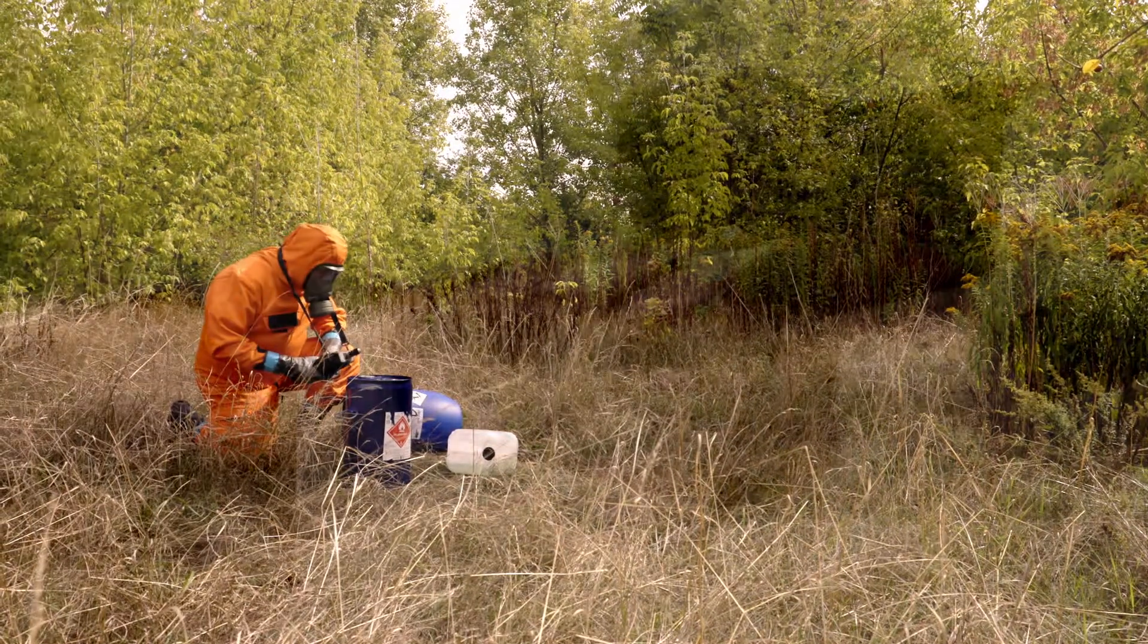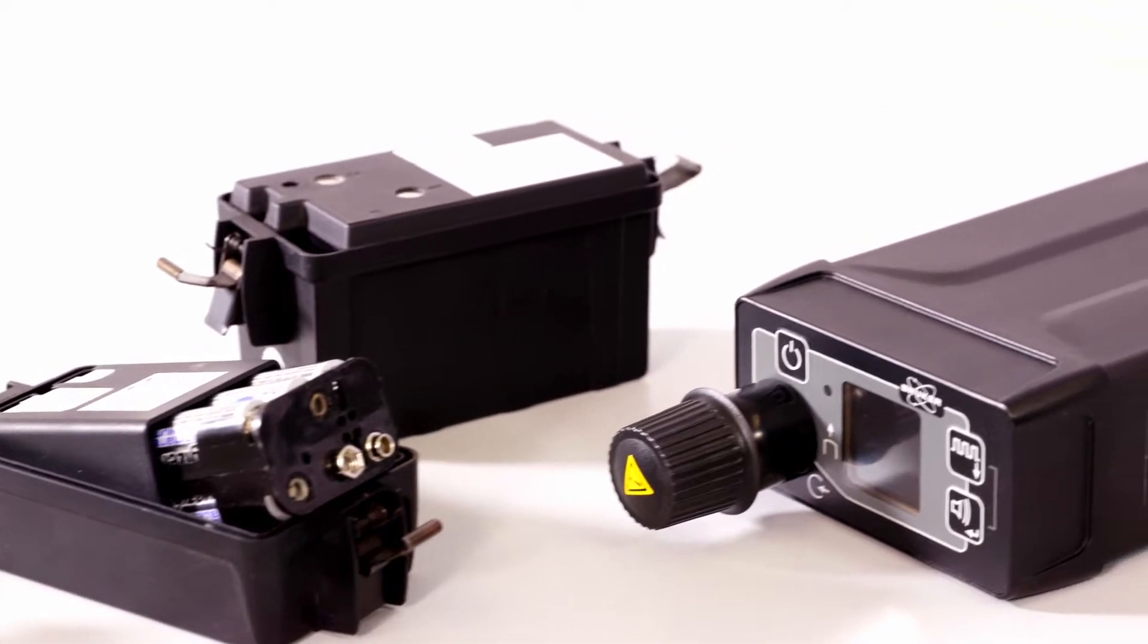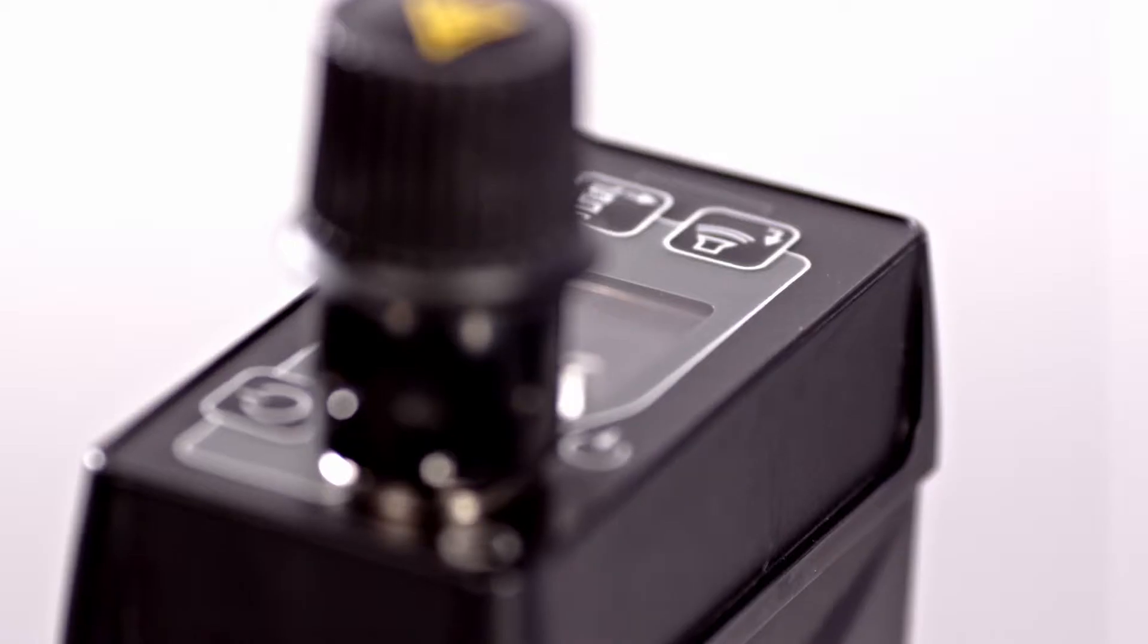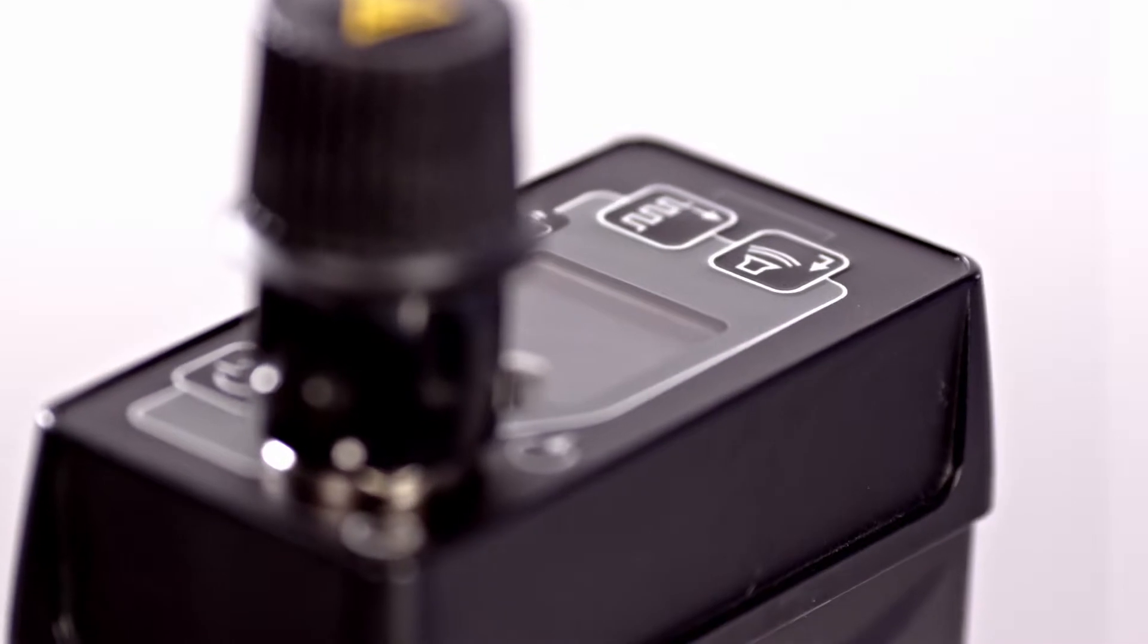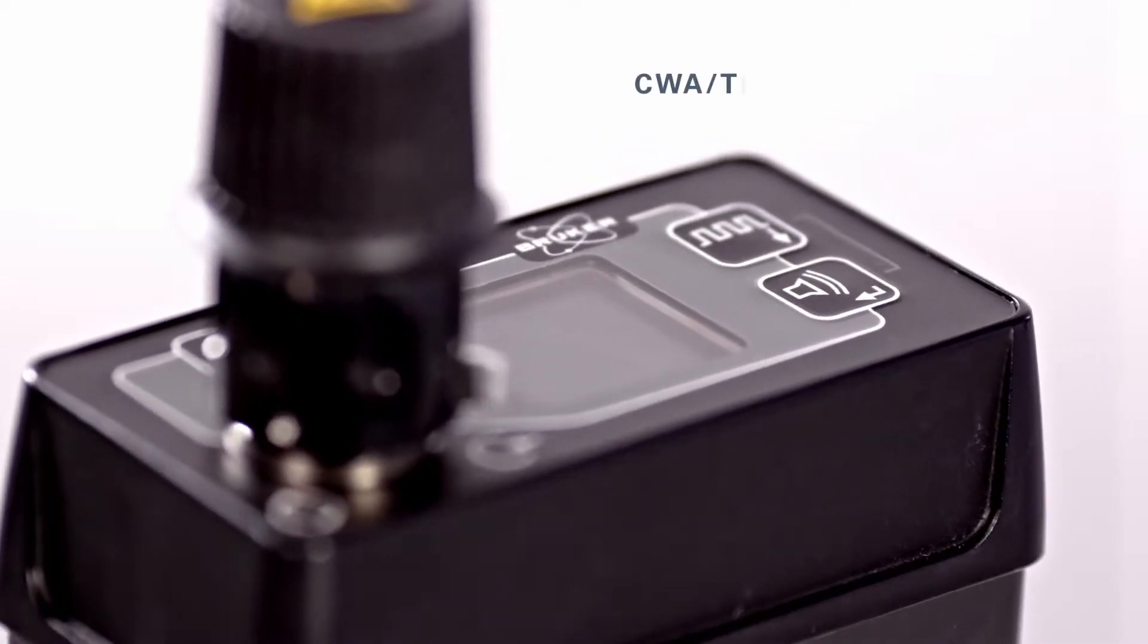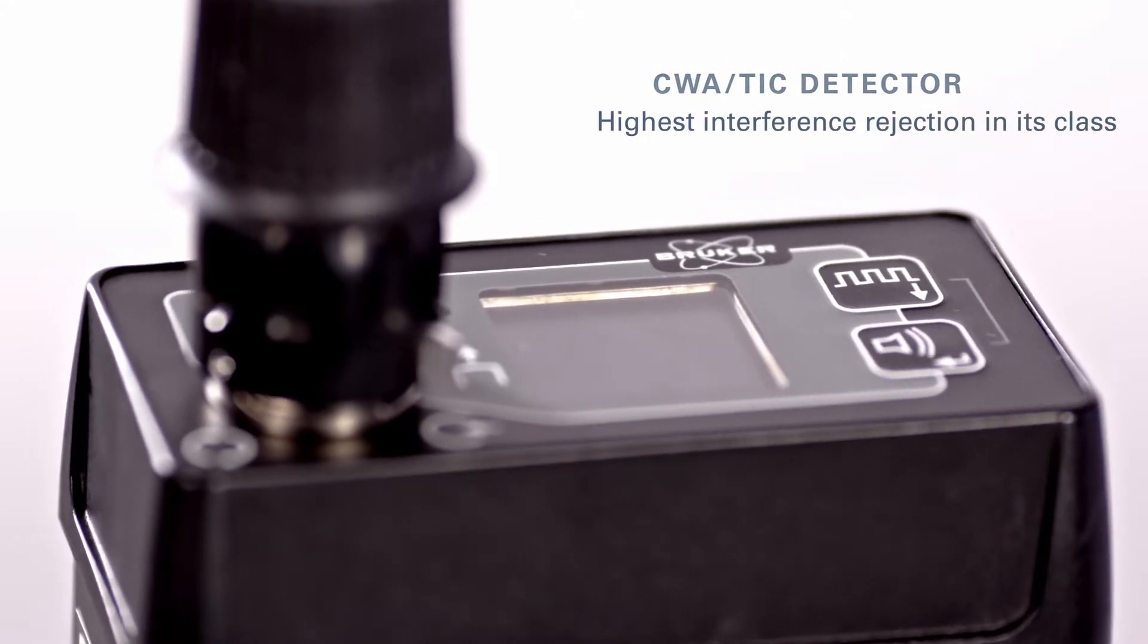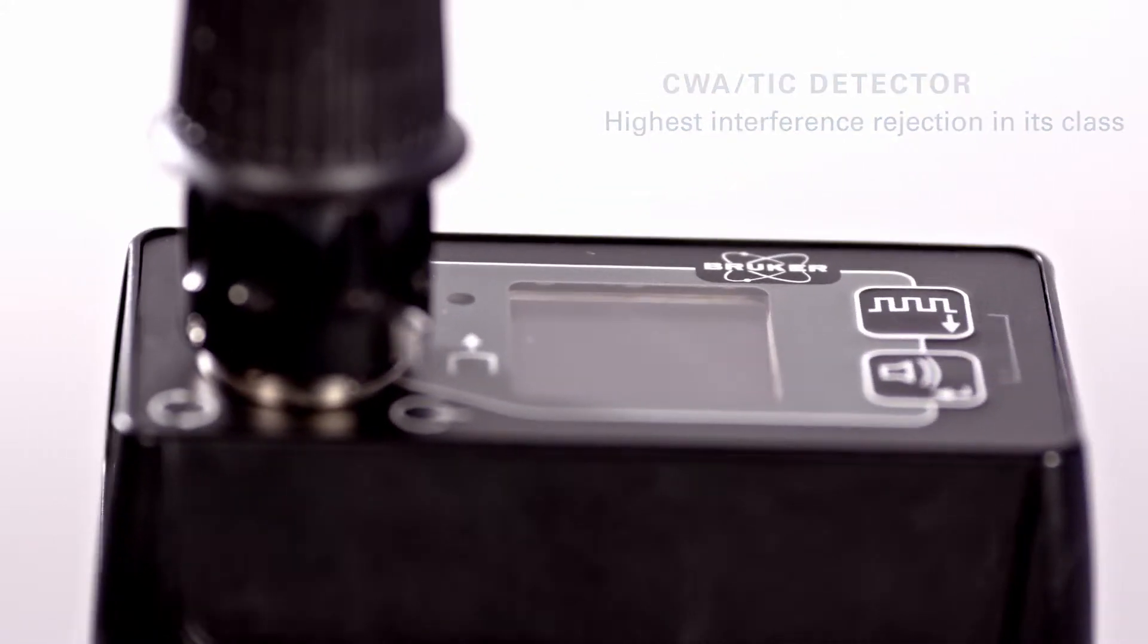MicroRAID Plus uses ion mobility spectrometry, which has been proven over time to offer the greatest sensitivity to chemical threats. It detects at PPM, PPB levels and has the highest interference rejection in its class.